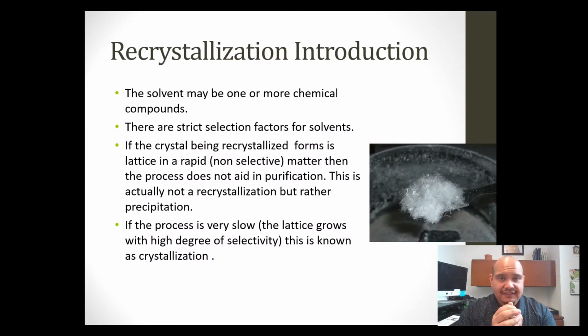And again, solvents can be one or more compounds. Consider water, very high on the polarity index, very, very polar. Consider hexane. Now consider that I have a crystal that might have polar and nonpolar compounds. You might think, oh, well, I can combine these two and make a solvent that has the best recrystallization properties of both. But if you thought a little bit more cleverly, you might find something wrong with that interpretation of solvent mixing or preparation.